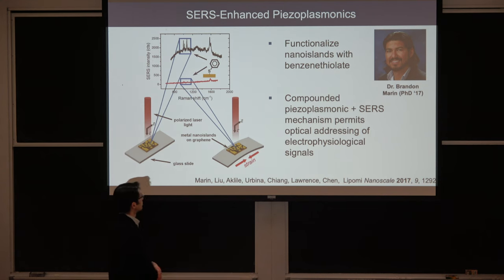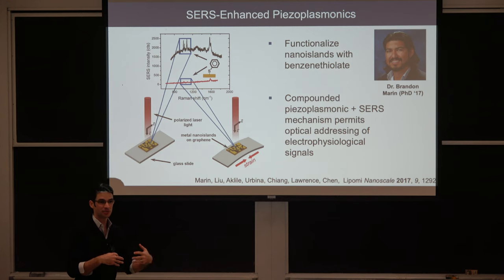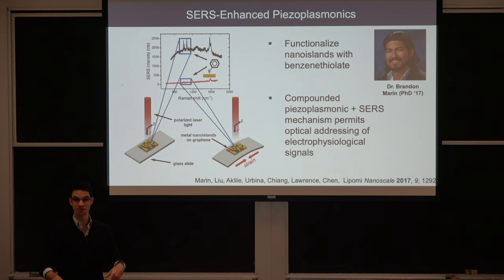So what this modality potentially allows you to do is measure the biomechanics of cells that don't beat on their own, because cardiomyocytes just beat, and it's a good thing too, right? Because we don't have to tell our heart to beat, it just does. But there are other types of cells, like muscle cells, that you have to send a signal to. So what if we want to measure the health of cells that don't beat automatically? This is an optical mechanism.